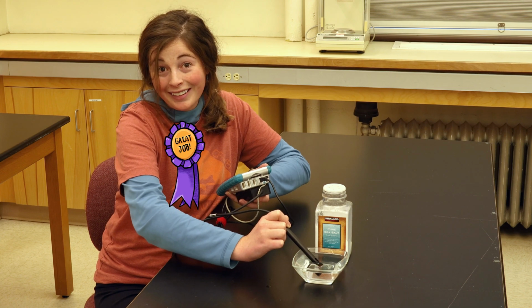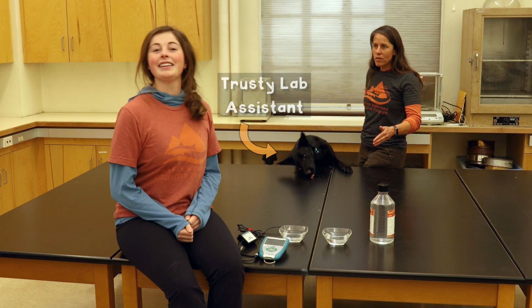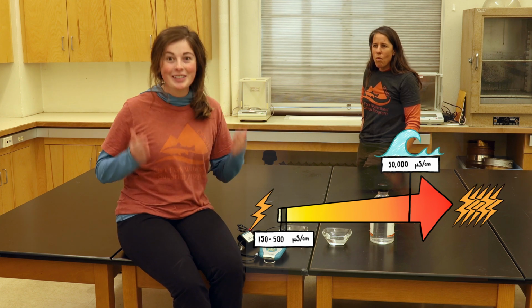I was right. Hey Caitlin, you were totally right. Yes. The more salt we add in the water, the higher the conductivity is. So we just added a little bit of salt into tap water. Ocean water is also salty. I wonder what the conductivity of the Pacific Ocean is. Well, I'm so glad you asked that, Dalit, because I looked it up, and it's 50,000 microsiemens per centimeter. Isn't that crazy? Wow, that is so high.